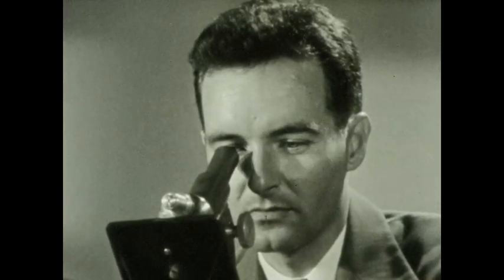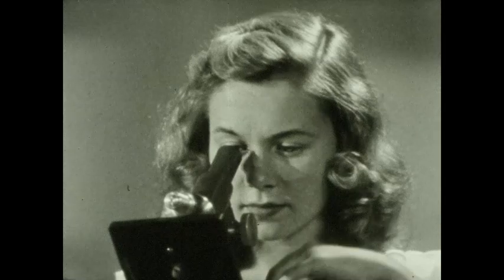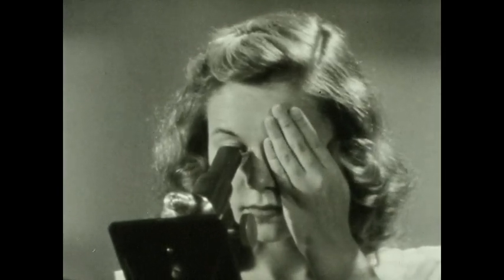A person trained in the use of the microscope learns to keep both eyes open while viewing the specimen. This helps avoid eye strain and makes the work less tiring. You can learn this technique too. Now, don't squint. Try leaving both eyes open and covering one eye with your hand. Concentrate on the view through the microscope. Then slowly remove your hand.